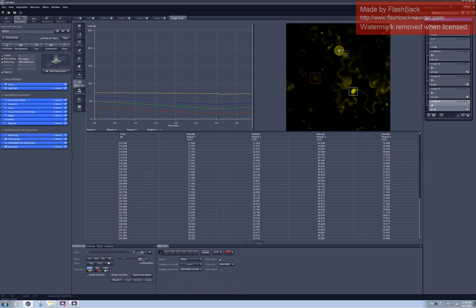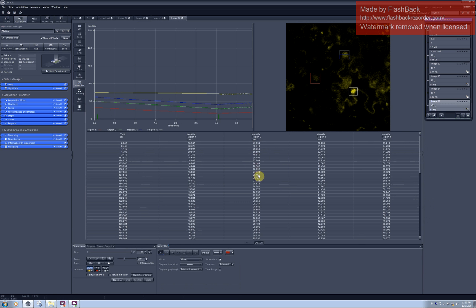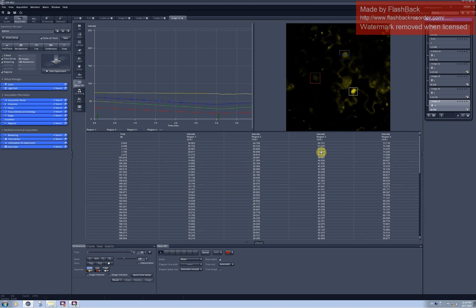In this nucleus I photobleached only the region within green rectangle. You can see that it went from values around 50 to values around 28. And the neighbor region which was not photobleached also lost quite a lot of intensity and went from values around 62-61 to values around 40-something.